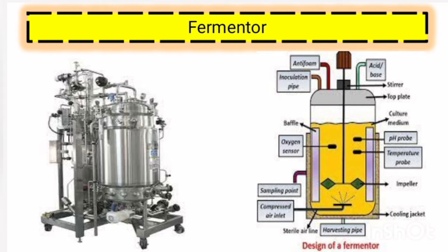Here, two figures are given. The first figure represents a typical fermenter, and the second figure represents the parts of a fermenter. Okay, note it.